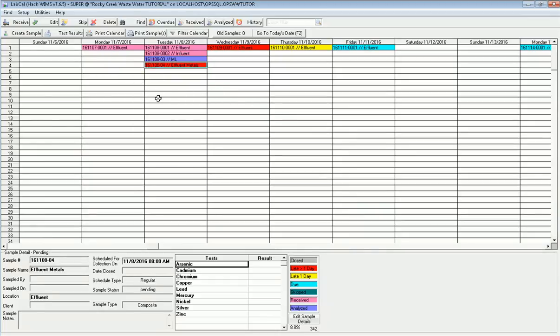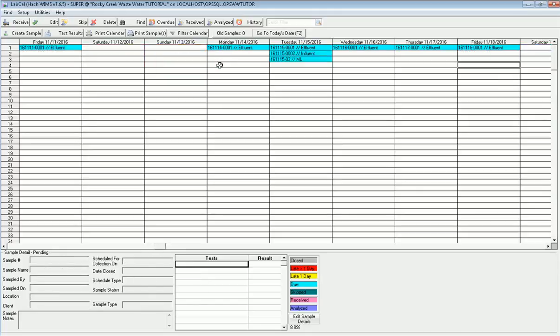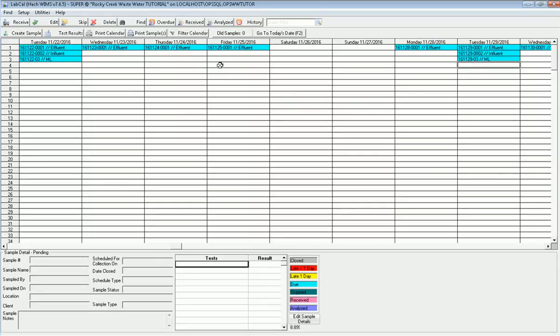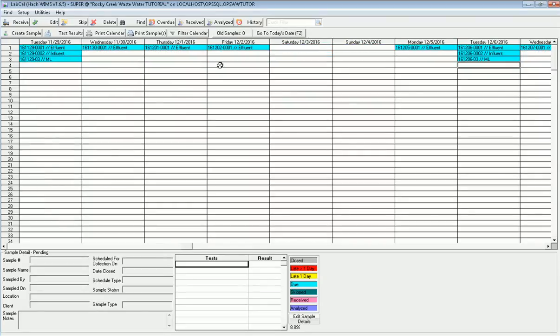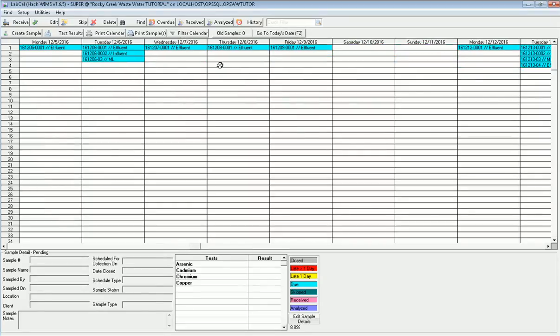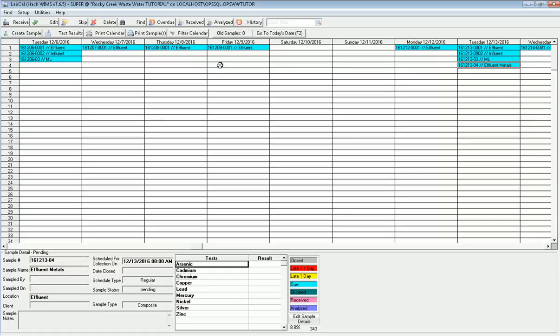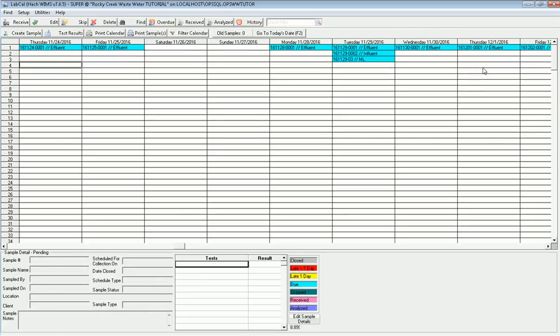What it does is, it puts that sample on the calendar. Here's effluent metals. You see all those tests are now listed to be run. If I go look out into the future, to the second Tuesday of December, there it is again. It assigns a unique sample number to it, and it's scheduled. You never have to schedule it again. It's going to show up on your calendar.